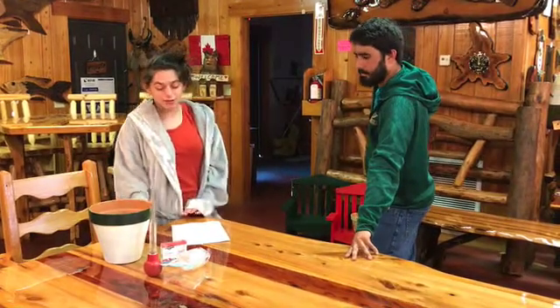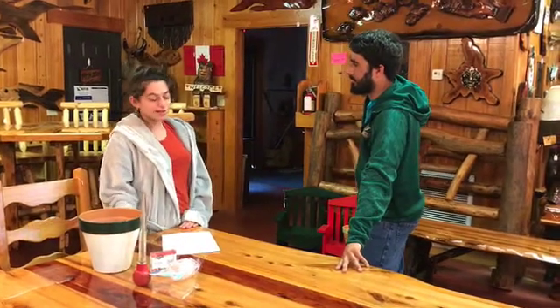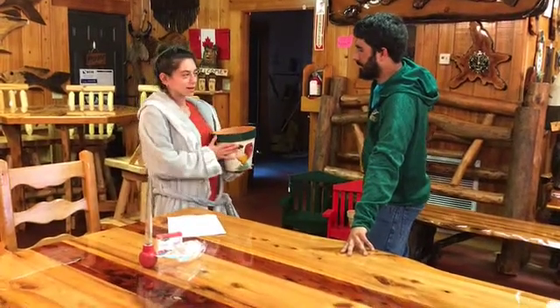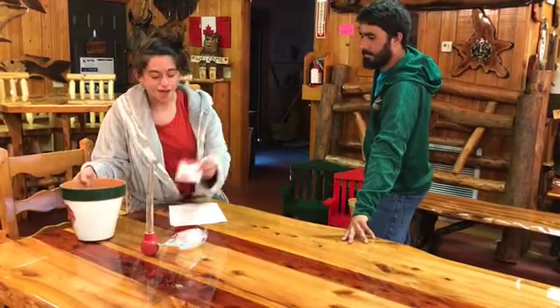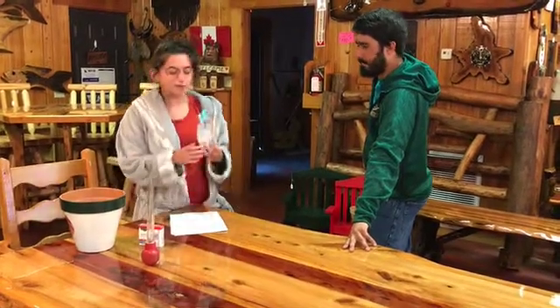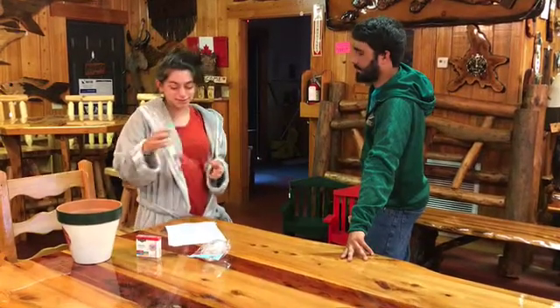The first thing that we need to do is understand our materials and what they are. We're a very underfunded lab, so they look a little funky. Here we have the spectrophotometer. I shouldn't lift it, it should be heavy, but that's okay. Here we have our Bradford reagent. Here we have cuvettes and parafilm. And here we have a pipette and tips.